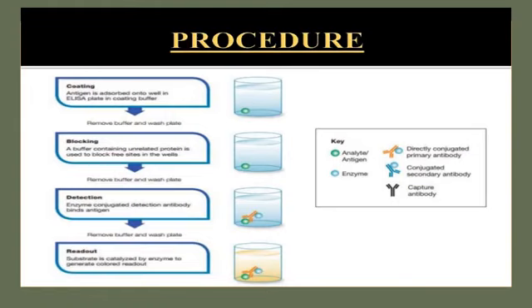These are the steps or the protocol followed in the direct ELISA technique. The first step is the coating of the antigen. The antigen is soluble in a certain buffer, so we add the antigen and we leave it depending on the instruction of the kit. If we use a ready-made kit, some recommend 1 hour incubation at room temperature. In some experiments it is advised to incubate it overnight.